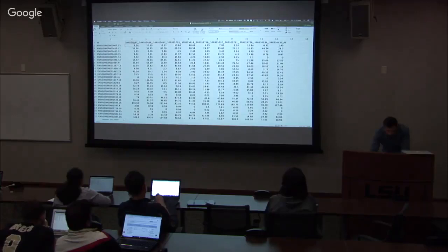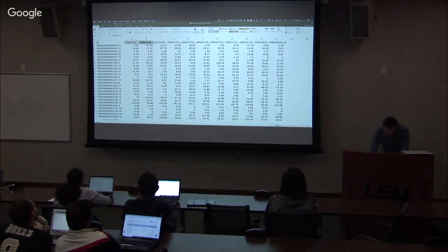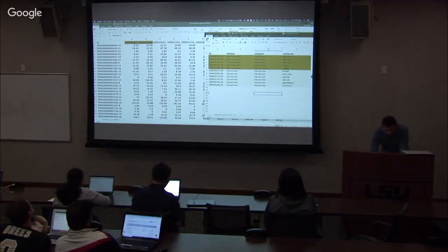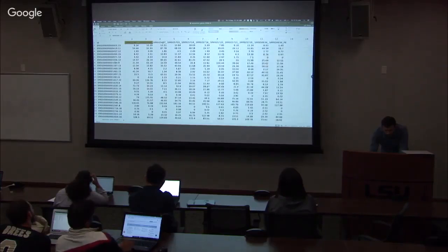So we can do these as green, as yellow. And then we have 697, 703, 714. All of these are claudin-low.